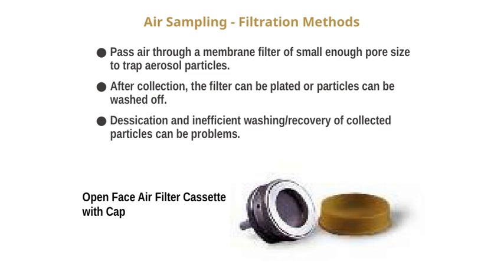Now, an important tool in this process is the open-face air filter cassette with a cap. It's a straightforward, practical device that allows us to securely hold the filter during sampling, ensuring we get a good sample while minimizing contamination. Overall, filtration methods are a vital part of air sampling because they enable us to capture and analyze airborne particles effectively, which is crucial in assessing air quality and safety.